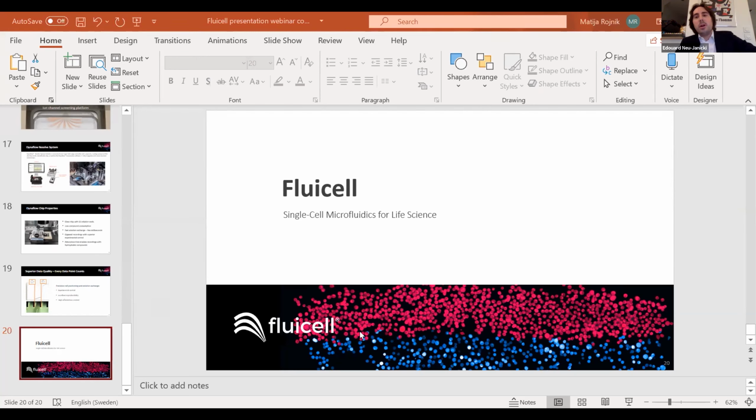Dr. Padmanabhan, are you talking about the Biopen? Okay, so with the Biopen, is the flow unidirectional? Sorry, can you specify what is unidirectional for you? He will be typing. He must type.